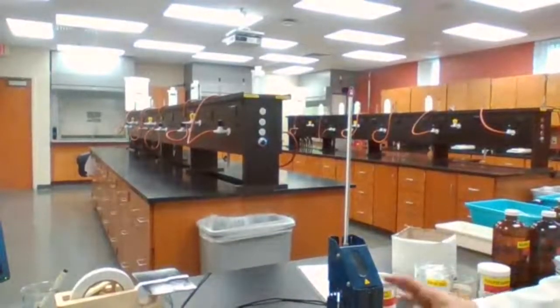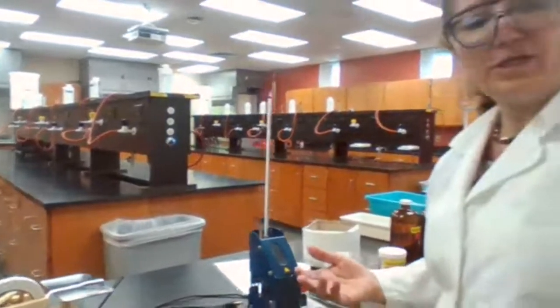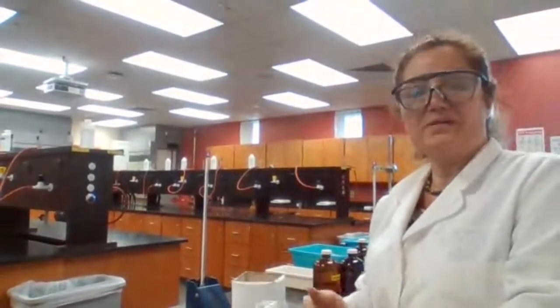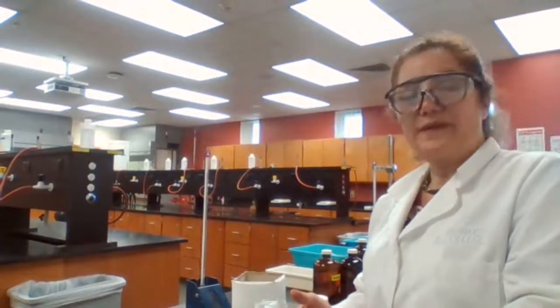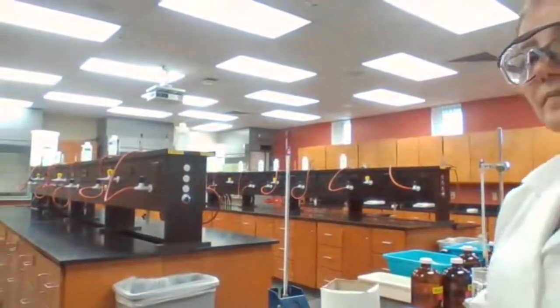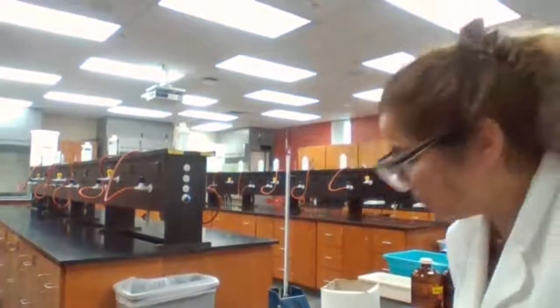While we are waiting for the melting of the sample to take place, I'm going to talk about solubility. The general rule for solubility is like dissolves like. So a polar compound would dissolve in a polar solvent, and a non-polar compound dissolves in a non-polar solvent. Sodium sulfate is an ionic compound, and ionic compounds are polar and can dissolve in water. Some of them are soluble, others are insoluble.